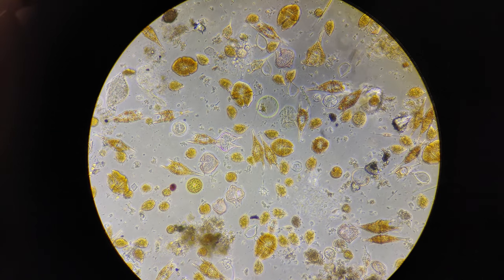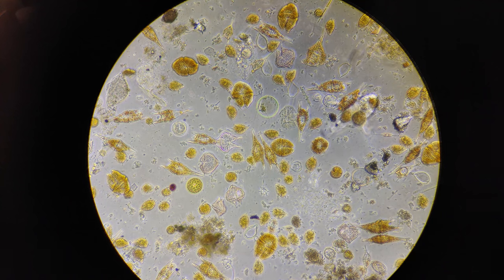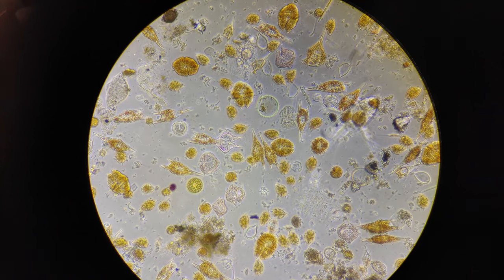Hey guys, today I'm going to show you how I built a plankton net, how I collected the plankton from the ocean, and what that plankton looks like under the microscope.